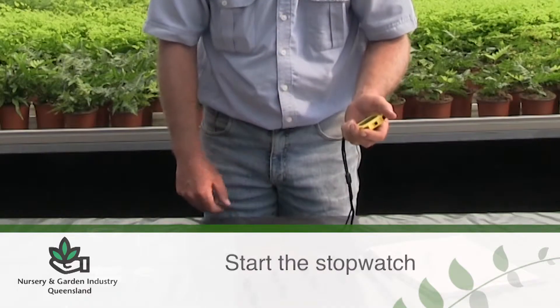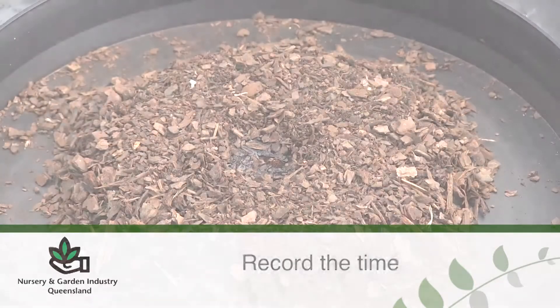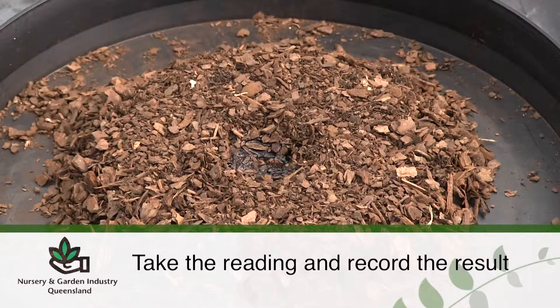Start the stopwatch. Allow the water to soak in. When the water has completely soaked into the media, record the time taken for the water to do so. Take the reading and record the result.